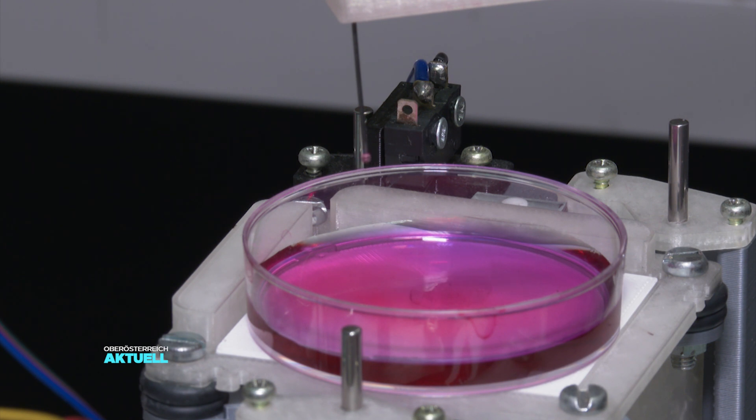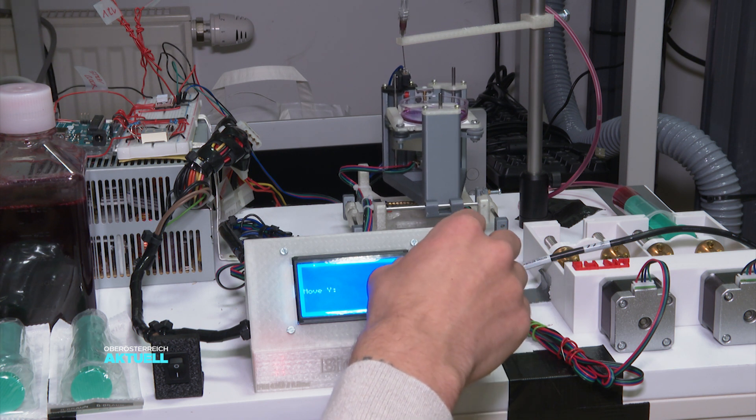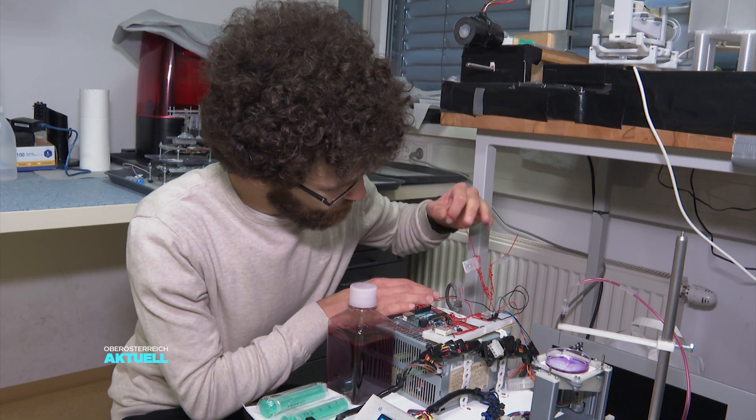Printing whole organs should be possible in 10 to 15 years' time. For this objective, bioprinters like this require further development. The Linz team has demonstrated that this need not always be expensive and that even an old DVD player can suffice.